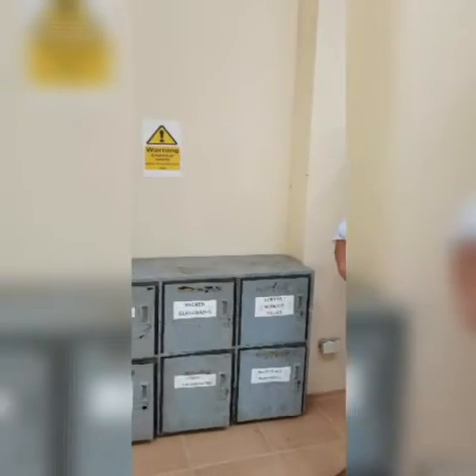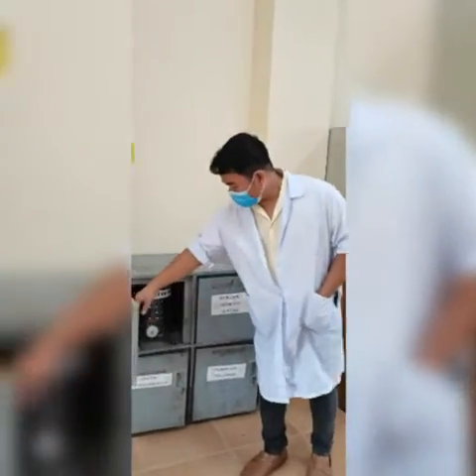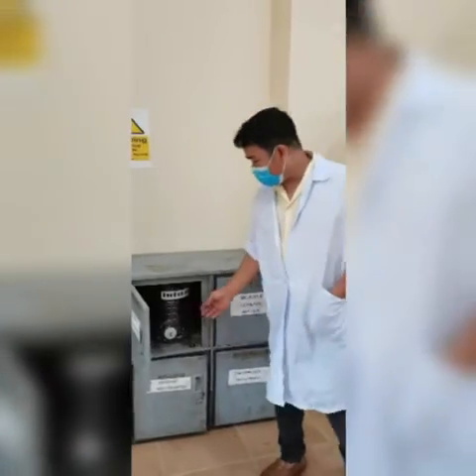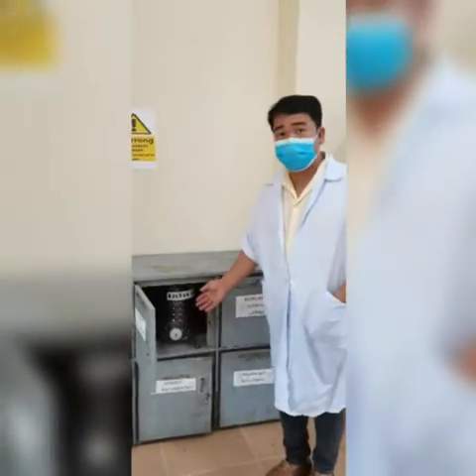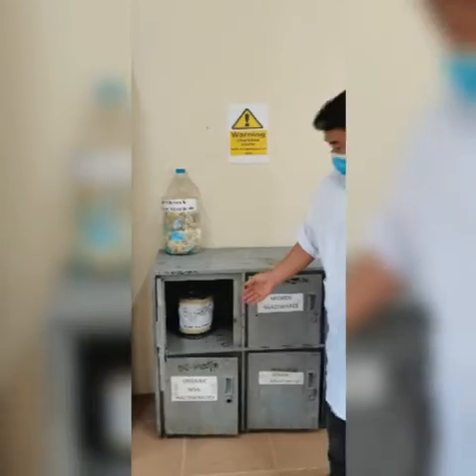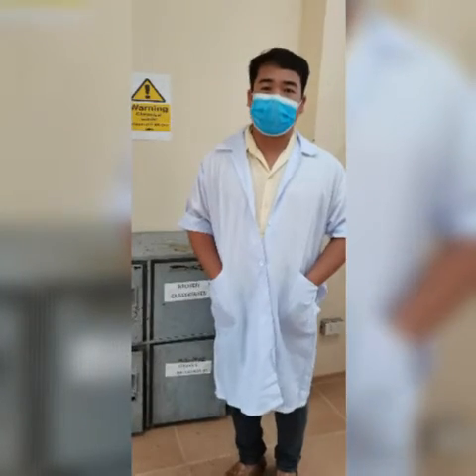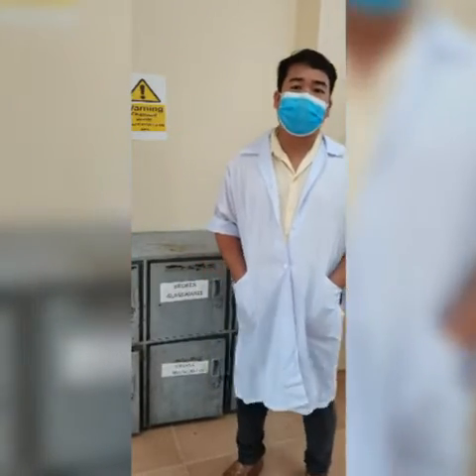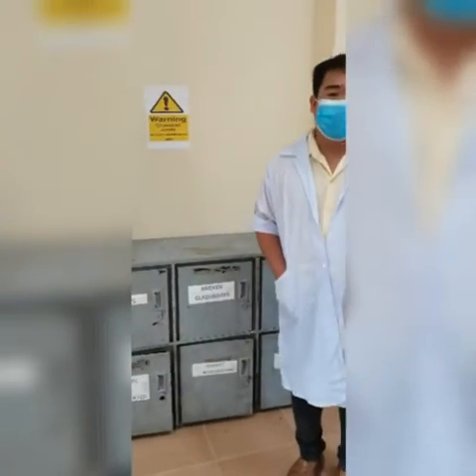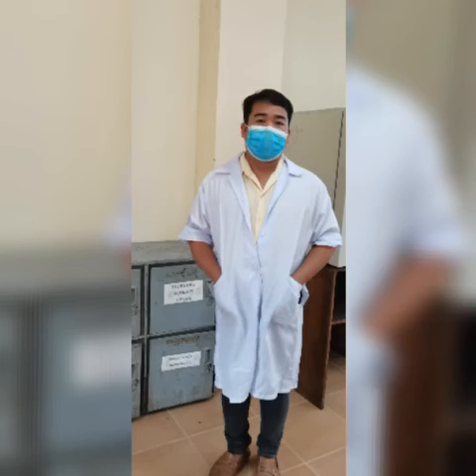How about the laboratory broken glasswares? For the broken glasswares, we also have the innovated containers or alternative waste containers. And we also have waste containers for the sharps. For the biohazards or the materials contaminated by biohazards, they are sterilized or autoclaved mechanically prior to disposal to the general garbage. And all these broken glasswares and other solid waste are kept inside or transferred into the general storehouse or collector house.